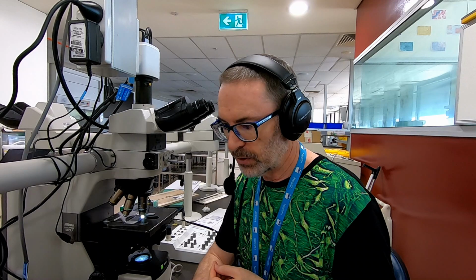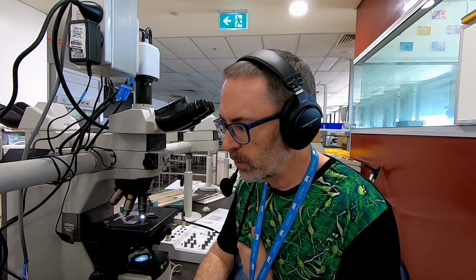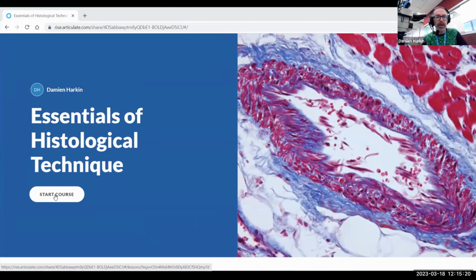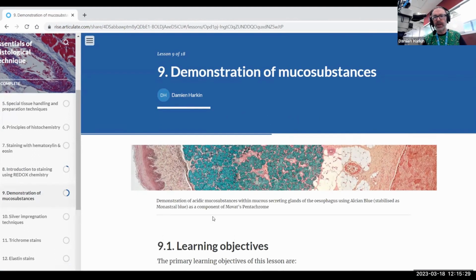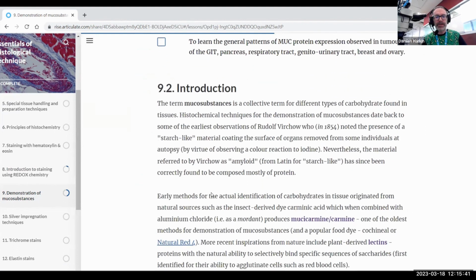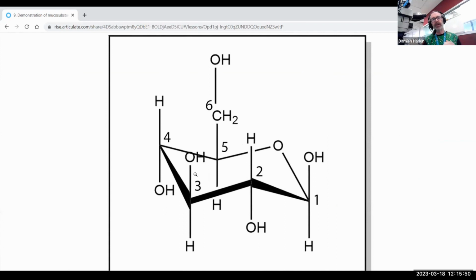Okay, so turning our attention now back to the screen here, I'm just going to share the online course. This is similar to the one that we use here at QUT, but this is the one that's made available to those who join the channel as a trainee histologist. If we make our way down to lesson 9 here, this lesson doesn't contain too much in the way of images. There's a Movat's pentachrome image at the start here, which I'll have a separate video on in a few weeks' time, hopefully. But really the benefit of sharing this information is that it provides some structures that I've created in ChemDraw as a way to provide a foundation for an understanding of the differences in the histochemistry of different mucosubstances.